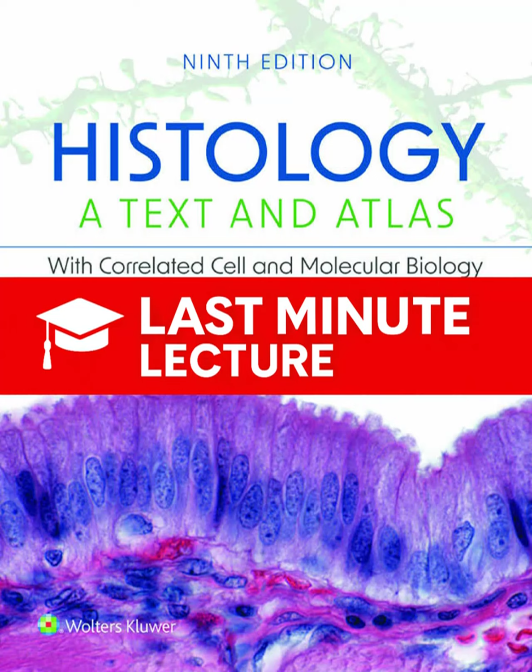So if resolution is king, then optimizing the microscope is the only way to get there. And the sources detail this indispensable process called Köhler illumination. Köhler illumination is the standard protocol for getting the best performance out of your microscope. It ensures that the illumination and the observation light paths are perfectly aligned and centered. Without it, even the best, most expensive objectives will give you suboptimal resolution and contrast. It's a 5-step process, and it starts with focusing on the specimen and then playing with the diaphragms.